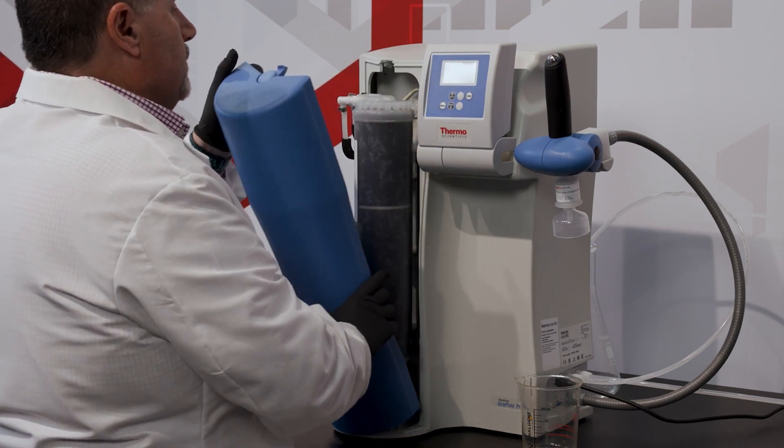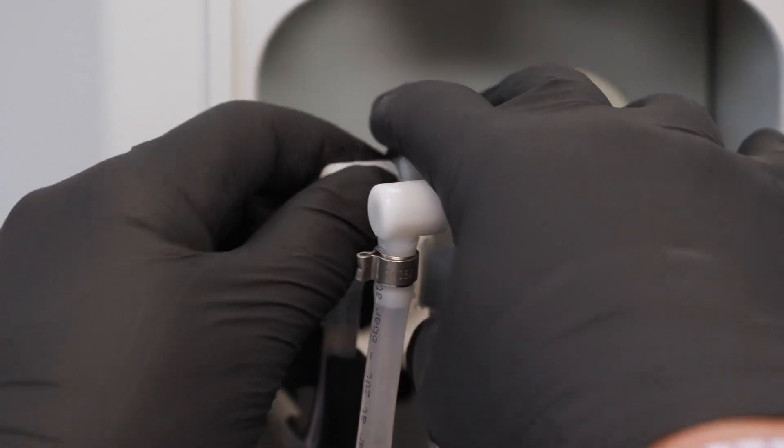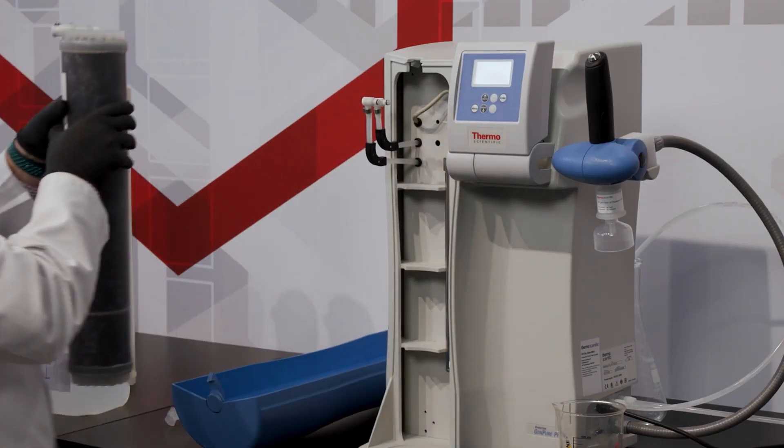Remove the front panel of the system and press the metal buttons to release the UltraPure cartridge. This will allow you to lift out and remove the expired cartridge.